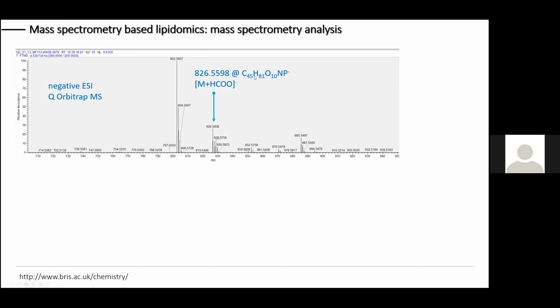So if we have an elemental composition, we can already think, okay, that might be our phosphatidylcholine lipid, which we looked at during the ionization event before as a formate adduct. But can we really say that we identified a lipid here? No. We only have the elemental composition of this analyte within certain mass accuracy ranges, for instance, 3 ppm.